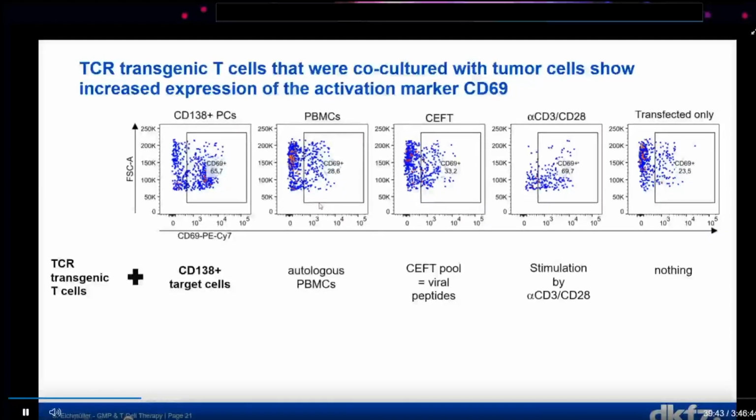We are again back to background. So this example shows us that this TCR here is in fact specifically reacting with these CD138 positive plasma cells.